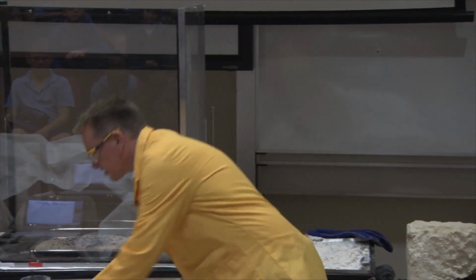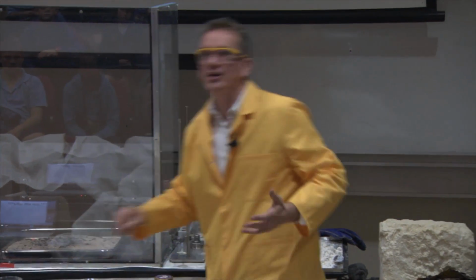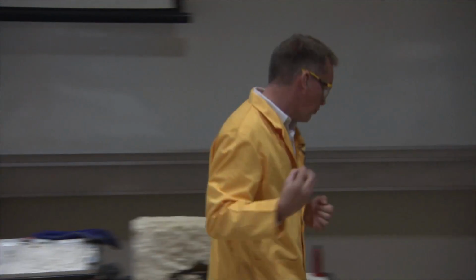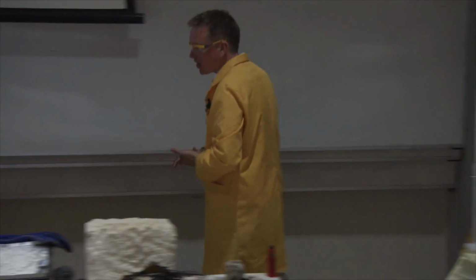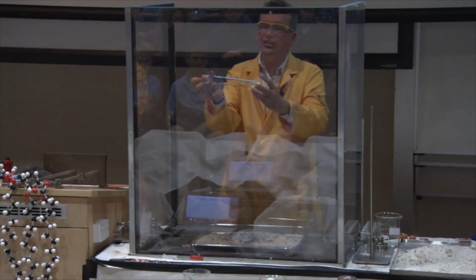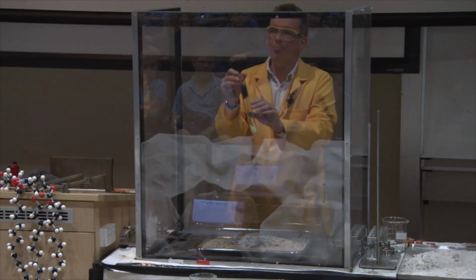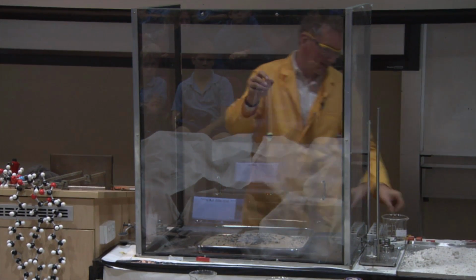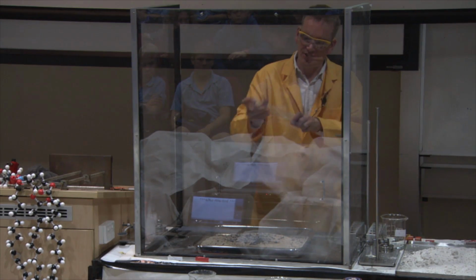Well, it's not just oxygen that can react with iron. There are other elements as well, such as the element sulfur. And I have some sulfur in here. So the sulfur is the yellow powder down the bottom, and at the top here we've got some iron powder. And it's just held on with a magnet at the moment. I'm just going to release that and shake it up, mix it up.